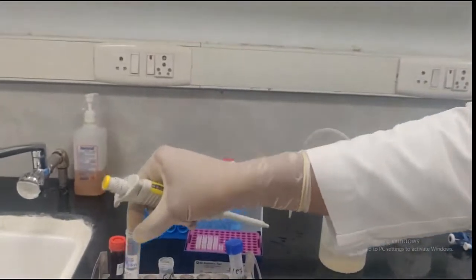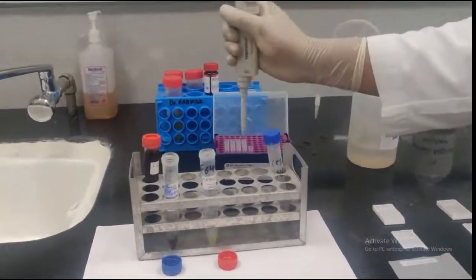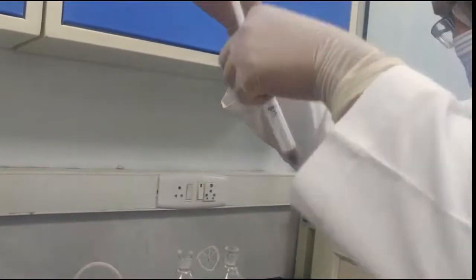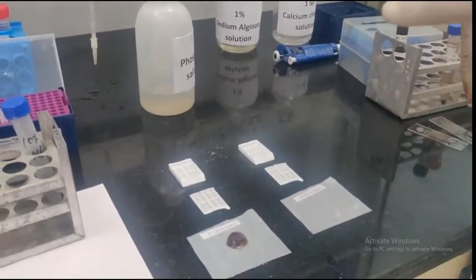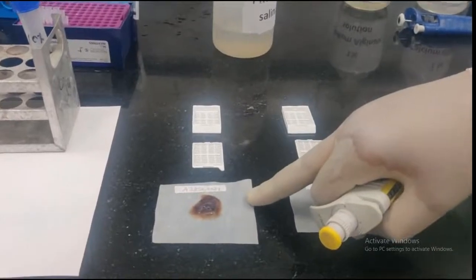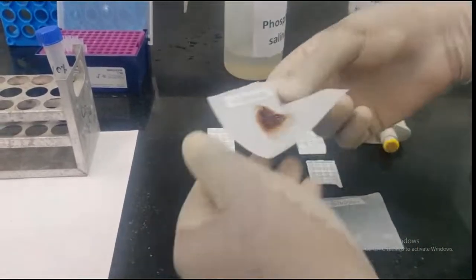The same has formed at the bottom of the other tube also. Now we'll take these tubes and dislodge the clot that has formed at the bottom using either the pipette tip or a spatula, but you have to gently dislodge it and then process it as a small tissue biopsy. Now we have put it onto the moistened filter paper that we have labeled with the sample ID, and now it will be packed and processed as a small tissue biopsy.